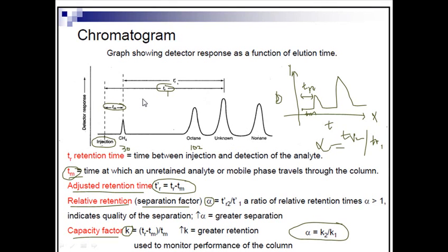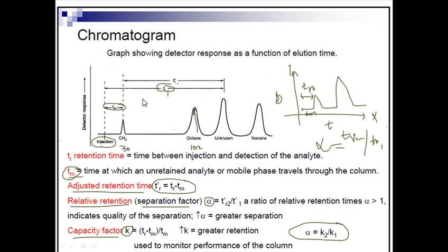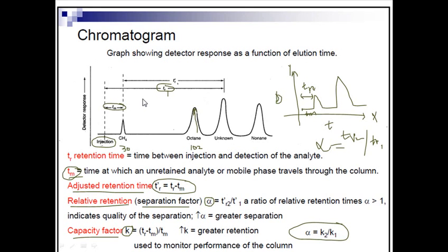Okay, so in this x-axis we have the time. So this denotes the actual time, and we have the detector response on the other axis. So this is detection over time. The higher the peak, the peak height tells us about the amount of the analyte molecule, and also the area suggests the amount, but the peak suggests the presence of a certain compound.